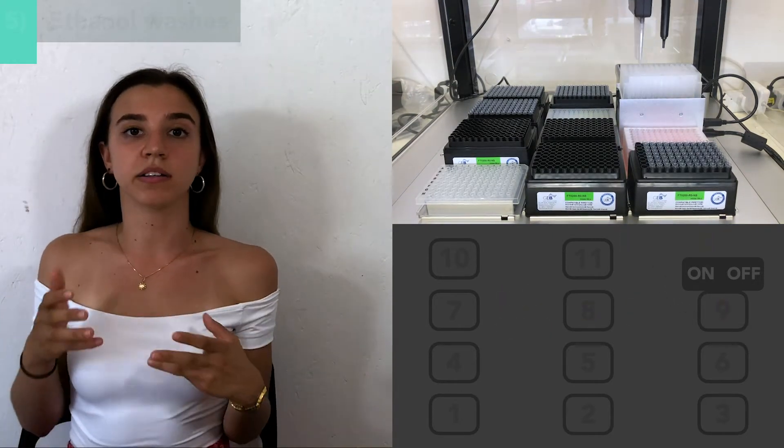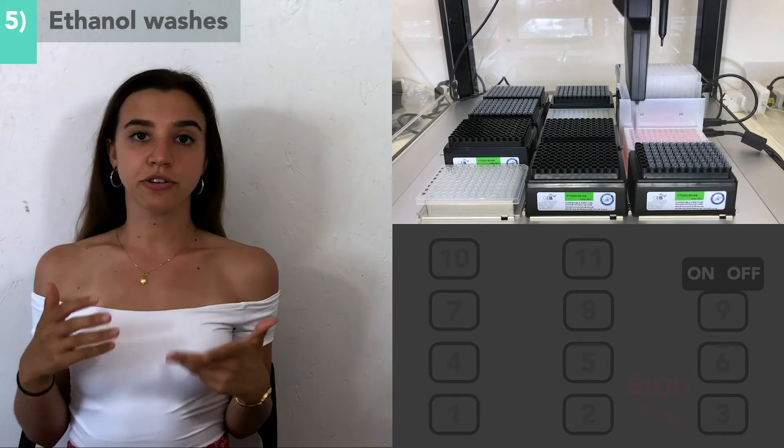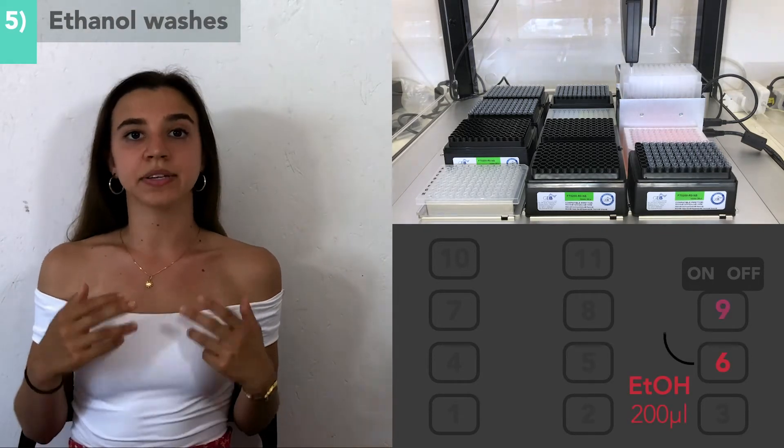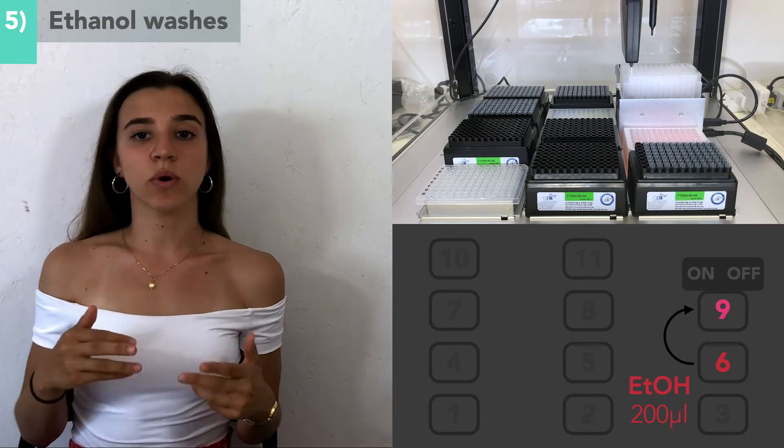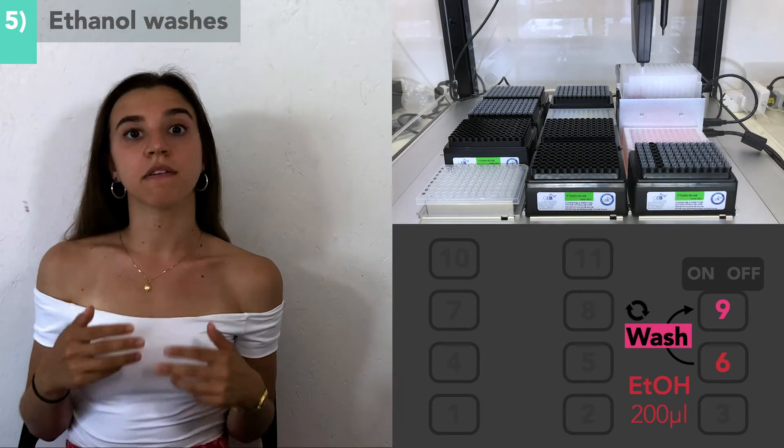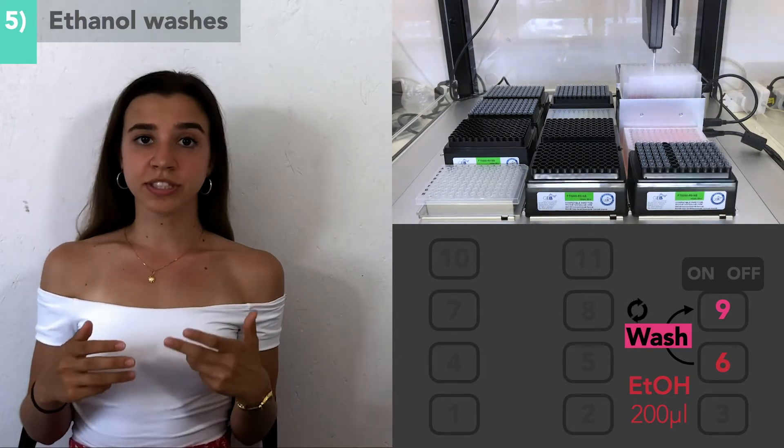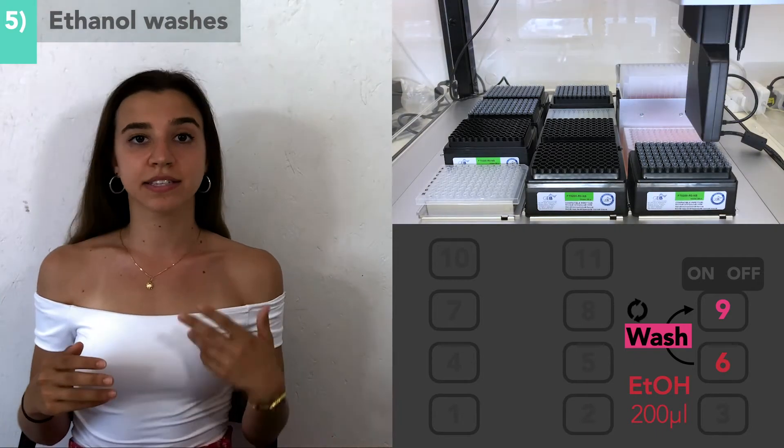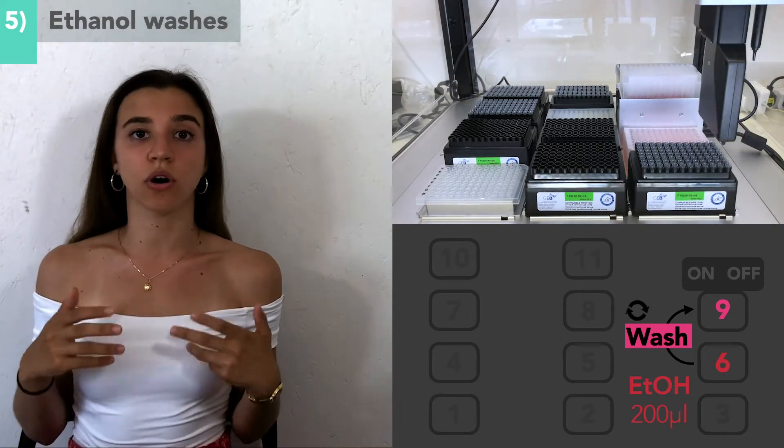Now comes the multiple rounds of ethanol washes. 200 microliters of ethanol from slot 6 will be added to each sample well in the same way that was done for the isopropanol wash. This will be repeated four times. The wash stages are very thorough to remove any contaminants as this determines the purity of your final RNA sample.